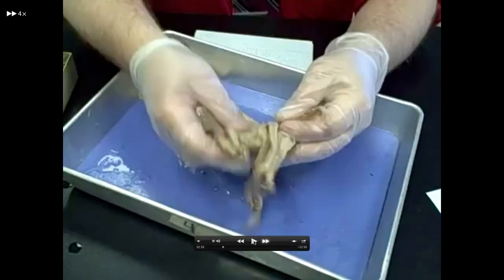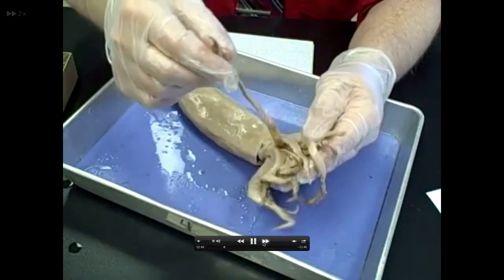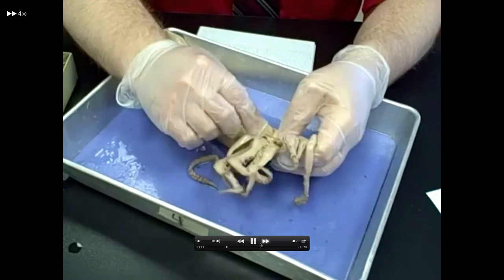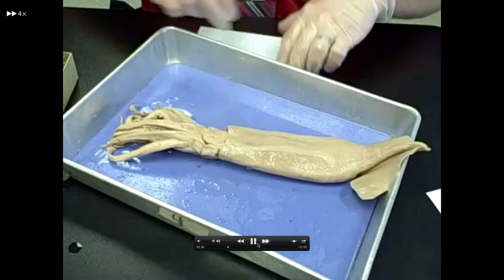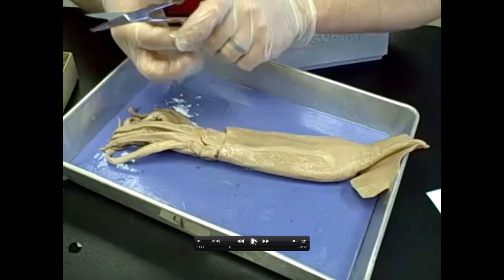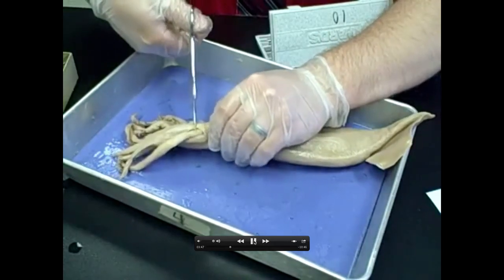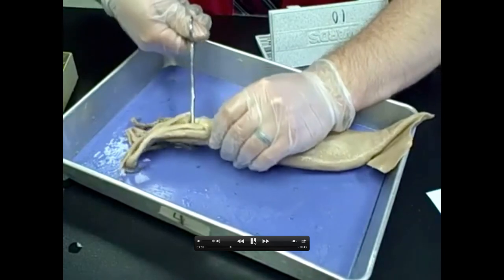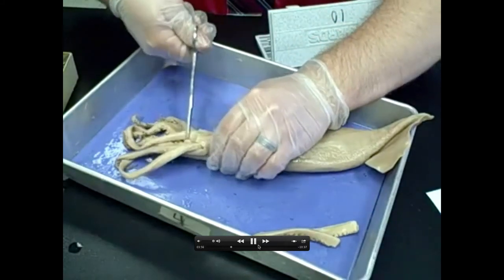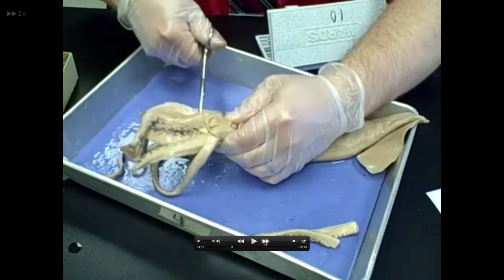So he's just showing you the tentacles here in the inside. He's showing you the suckers on there. And then pretty soon he's going to cut off the tentacles so that we can see the buccal bulb and the beak. He's going to use dissecting scissors to do this. And he's going to cut off the tentacles just so you can see the tentacles a little better. And he's also going to cut the beak out, the buccal bulb, so that you can see the beak. And that's what they do when they're ready to cook calamari. That's what they do. So I'm going to fast forward a little more so we can go a little faster with that.